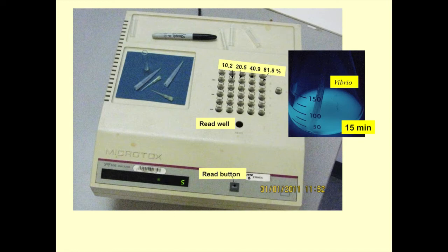It uses this luminescent organism, a marine bacterium called Vibrio fischeri. So you put little aliquots of this into, usually the way we do it anyway at ALS and most other labs, 5 of these little cuvettes which go in the wells in row B, set up a series of dilutions of the test solution in row A, including a control in the first column, and then transfer into row B and measure the light output.